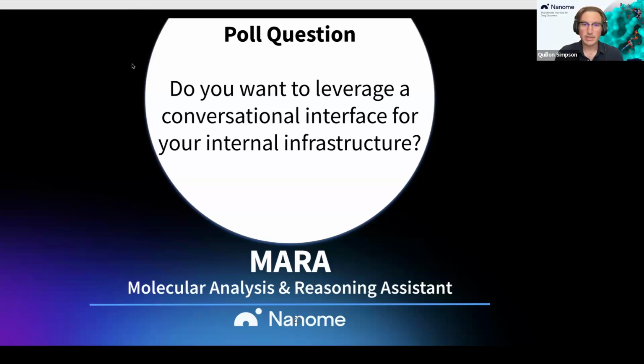But to reiterate what Edgardo said, the public beta is a fantastic location to try out some of the tools and functionality of the Mara platform, but it really is best just as a try before you buy type environment. If you want to really leverage the full power of the Mara ecosystem, we encourage you to talk to us. We're in early discussions with, and have a couple of companies that we've onboarded as early adopters, and we're really able to work quite integrated with your organization to provide some of those more secure, sensitive deployments of Mara.